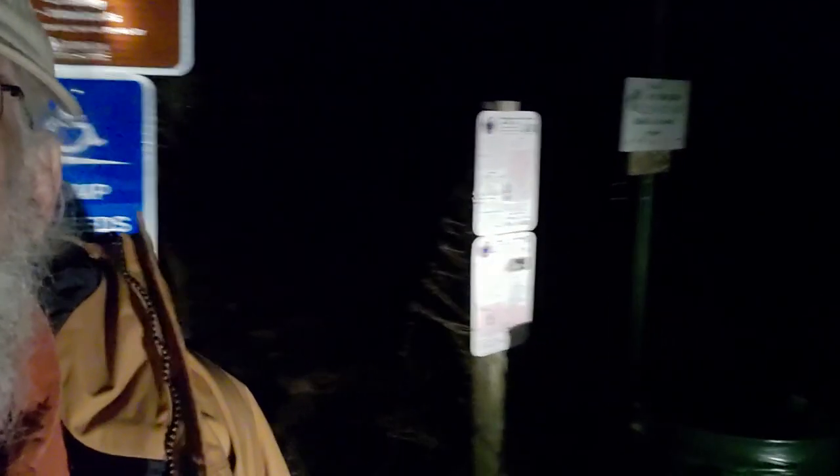Morning, Riverkeeper here, doing a little late night — okay, it's early night, an hour after dark — water quality sampling. In this case, the state line boat ramp, which is hard to tell by actually looking at it because you can't see it, but you can see these are our water trail signs.